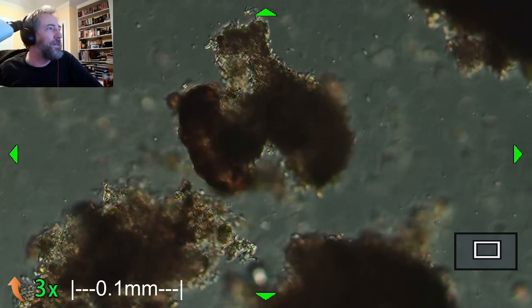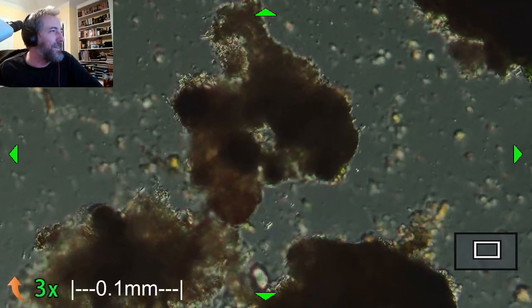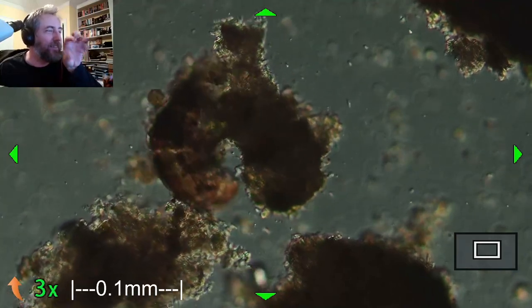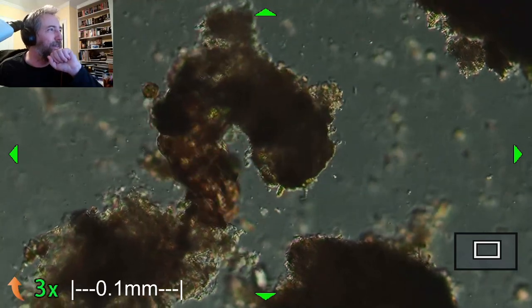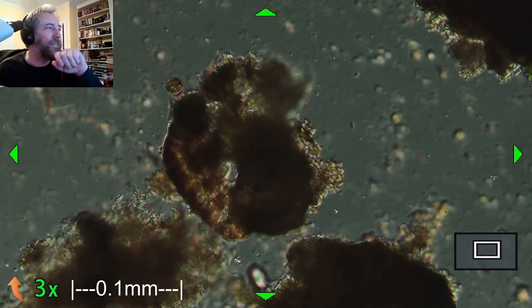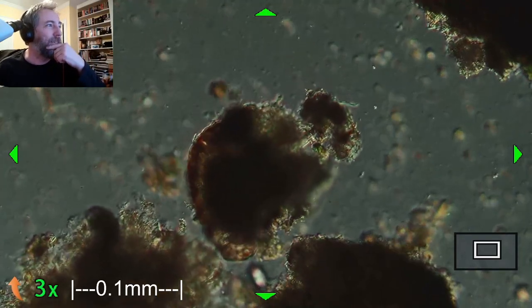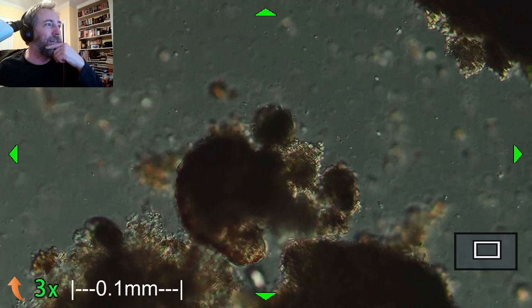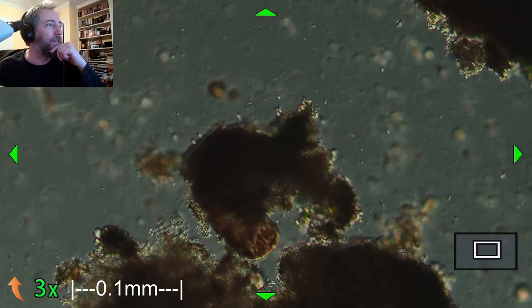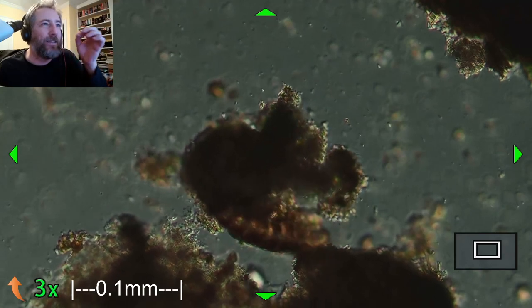This water bear's a little out of focus while I'm typing and talking. There he is. He's crawling around. You can see they've got like a little suction face thing, like a vacuum cleaner, basically. And that's how they eat. That's how they interact with things. Most water bears don't have eyes. I can't tell you whether this one does or not. I can't find one that's sitting still long enough for me to see them. Most of them don't have eyes at all. They might have little patches where they sort of can sense light a little bit.